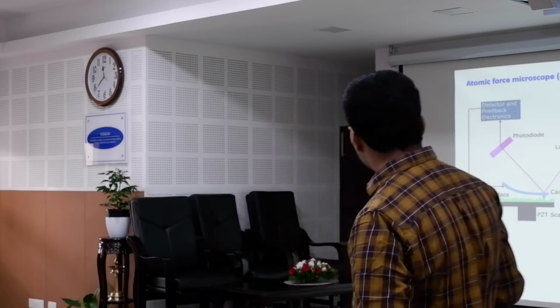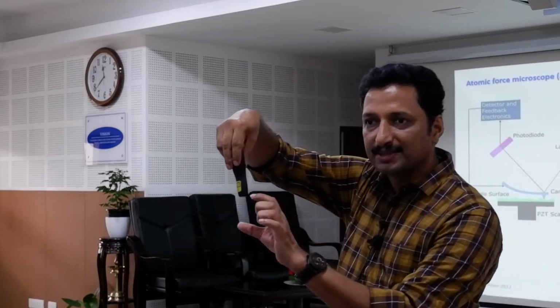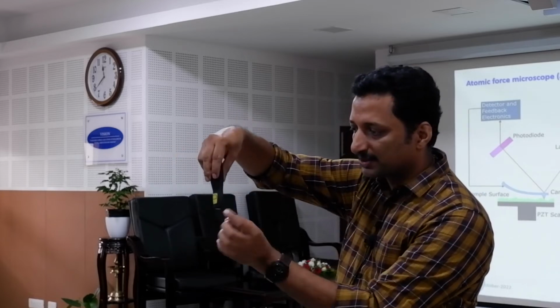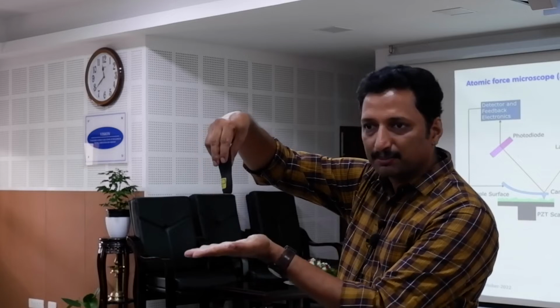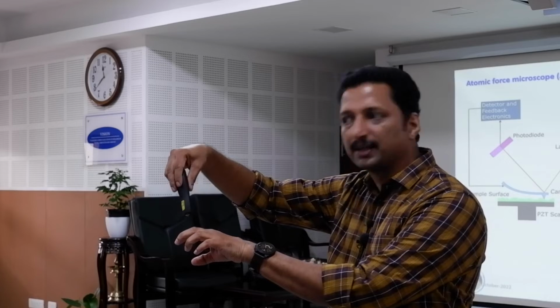The deflection of this cantilever can be because of the rubbing of the tip on the surface, or the tip can be away from the surface but there is still van der Waals interaction. You will get deflection because the tip is attracted by the surface. If there are molecules there, that attraction will again depend on the sample-to-tip distance, which is important here.